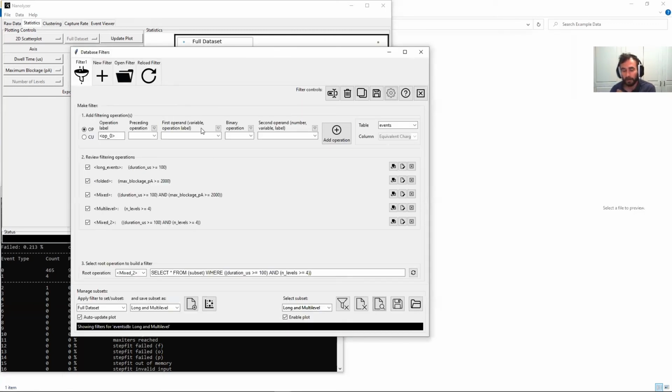In addition, while building these filters can be a pain the first time, just like the analysis setup, you really only have to do this once because you can save these things. So you can save a filter, which saves a special file that encodes the filters you've used here, and then you can later go back and load them through this open filter button here, so that you only really have to construct these filters once. And once you've set these up, these numbers are easily interchangeable.